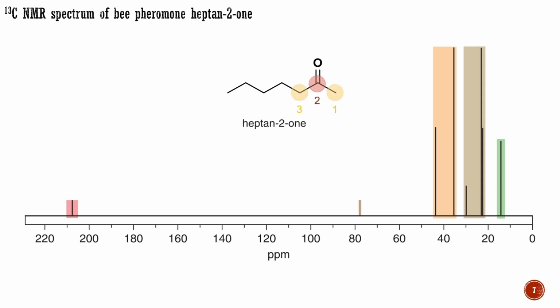The 2 carbon atoms next to the carbonyl group come at lowest field, while C7 is at the highest field at 13 ppm. It is important that there is the right number of signals at about the right chemical shift. If that is so, we are not worried if we cannot assign each frequency to a precise carbon atom, such as atoms 4, 5, and 6. As I said before, do not be concerned with the intensities of the peaks in carbon NMR.